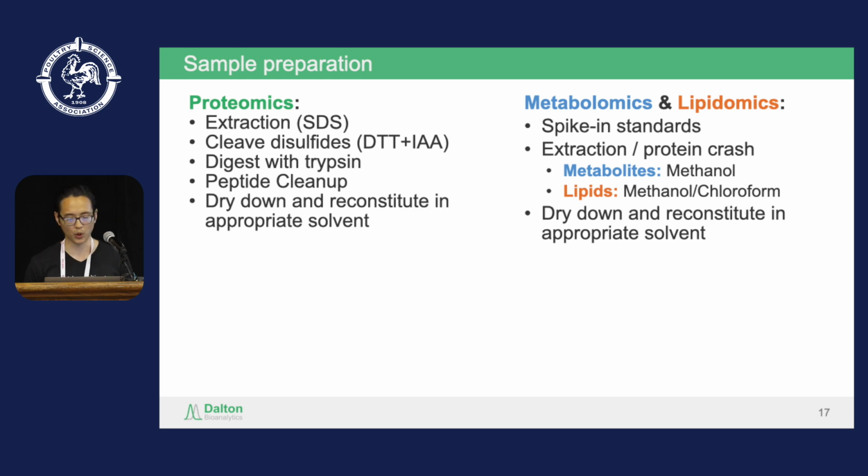In contrast, proteomics is quite complicated. You basically have to solubilize the proteins. You have to cleave and cap the disulfides. You digest it with trypsin for a few hours, and then you clean it up before you dry down and reconstitute and analyze.